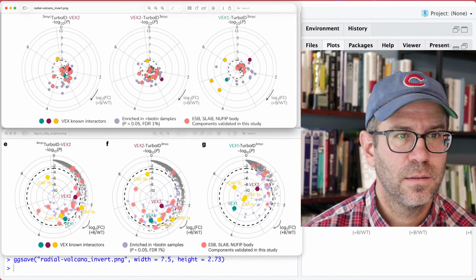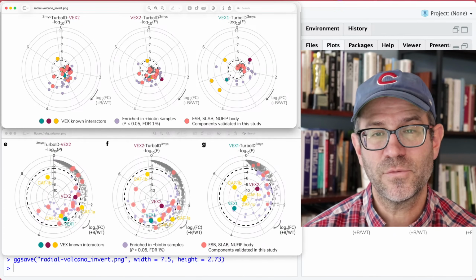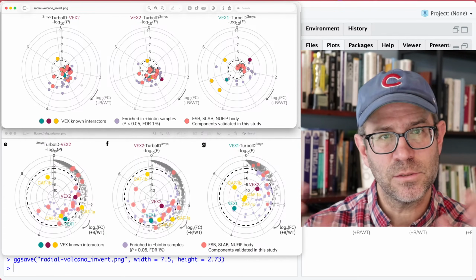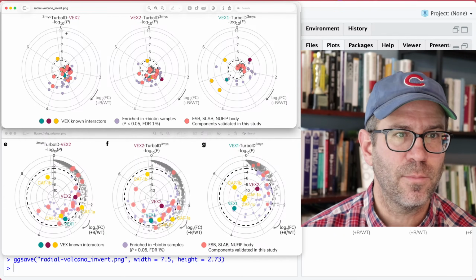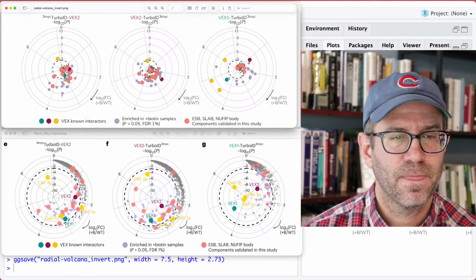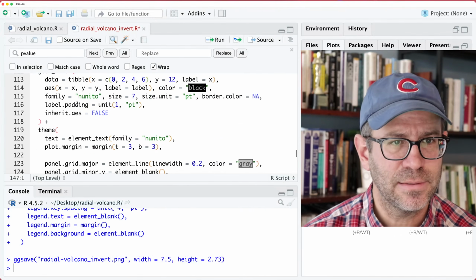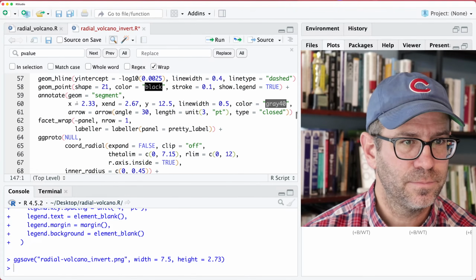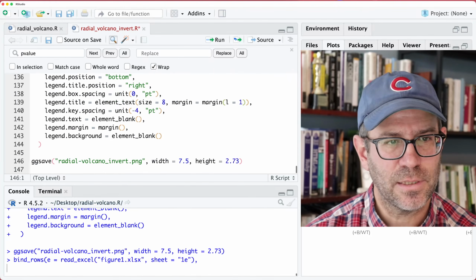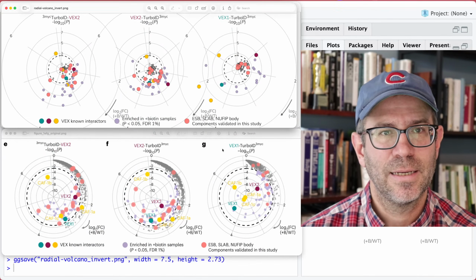And that gives you far fewer points that are significant, I think. And we could then zoom in a bit more, right? So here I'm going out to like 11 or 12, but we could zoom in. So this is 7. So if you go to like 8 on chord radial, and then that's going to throw off our arrow and our labels, but that's all good. That's beautiful.